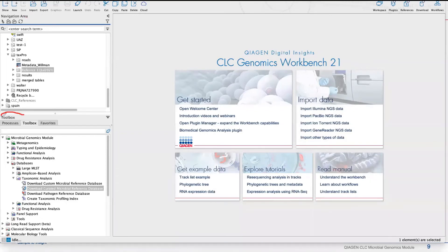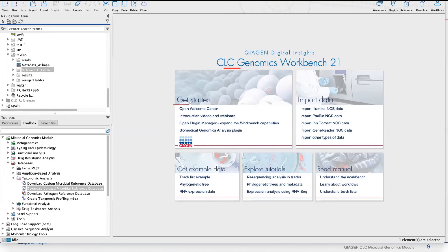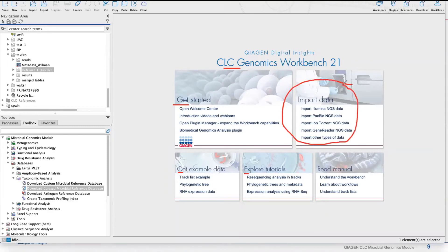Below the navigation area is the toolbox. This is where I'll be going to use the different tools within the workbench to execute different bioinformatics analyses. We also provide a quick-start guide right here in the middle of the working space — getting started, example data, exploring tutorials, and how to import different data sets.